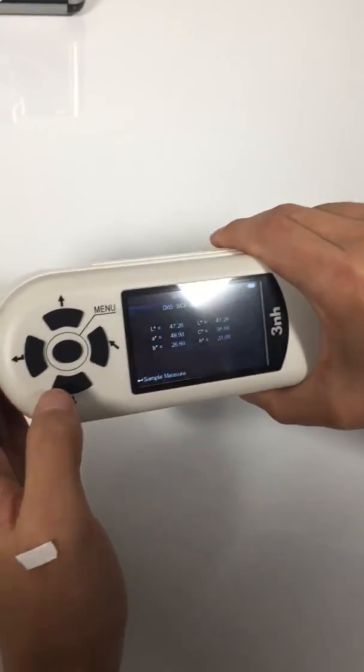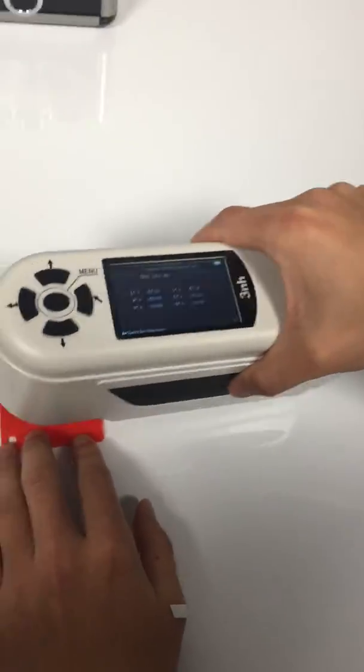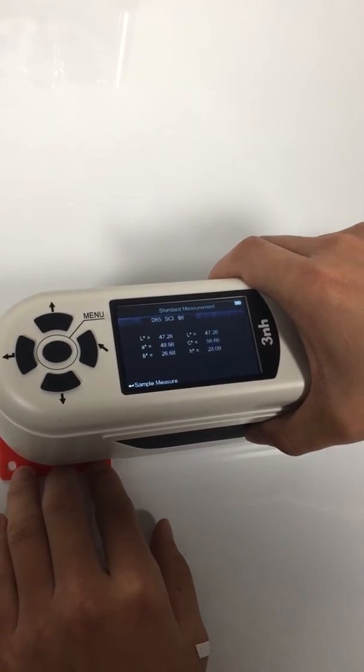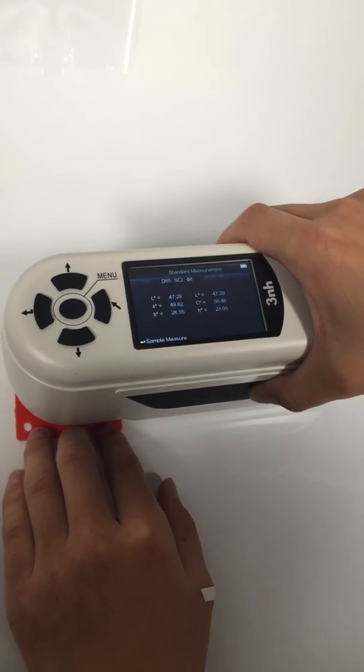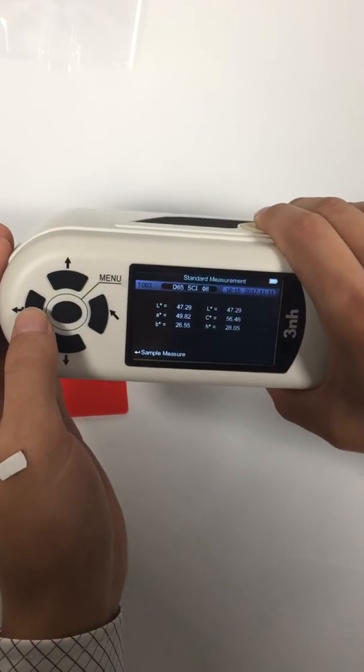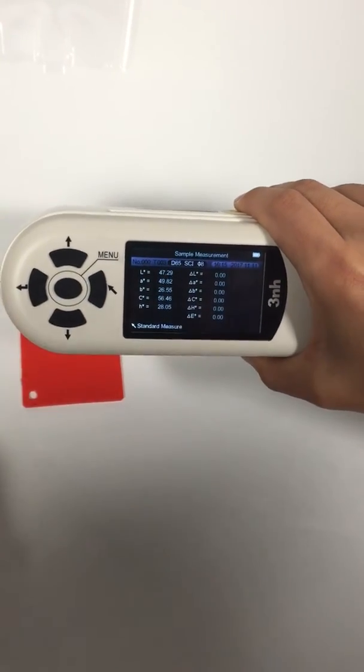It's ready for measurement now. First measure the standard, then measure the sample.